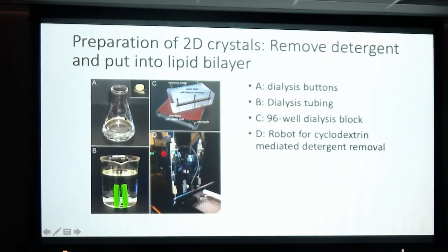Over a period of days, the detergent dialyzes out, and the lipid you added forms some little lipid micelles, and the protein gets inserted into the lipid bilayer and hopefully concentrates and crystallizes. In B, there's the other standard dialysis technique: instead of using these little buttons, if you have a lot of protein, you can use a dialysis bag, but that takes a lot more protein. So generally, I would say buttons are more popular.